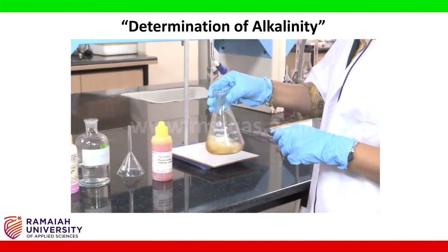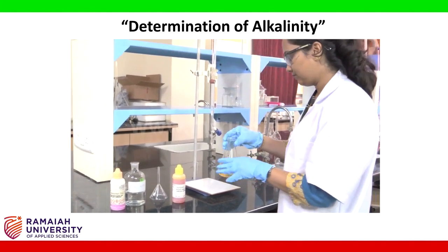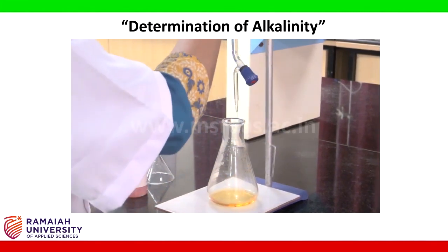The color changes to orange, and then continue the titration with sulfuric acid.